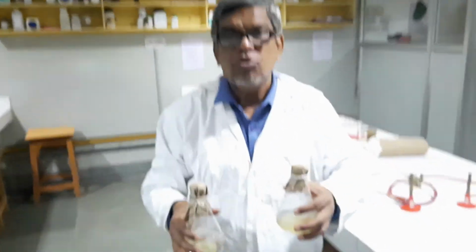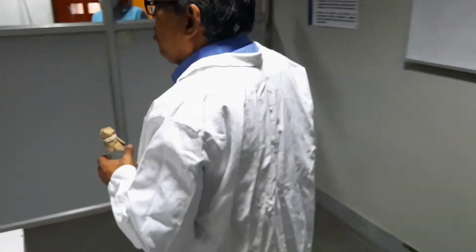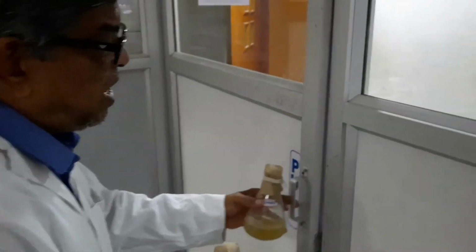I am going to autoclave it in the autoclave machine. You know, autoclave is a verb also, autoclave is a noun also. I am going to autoclave in the autoclave machine, right? This is the theory.